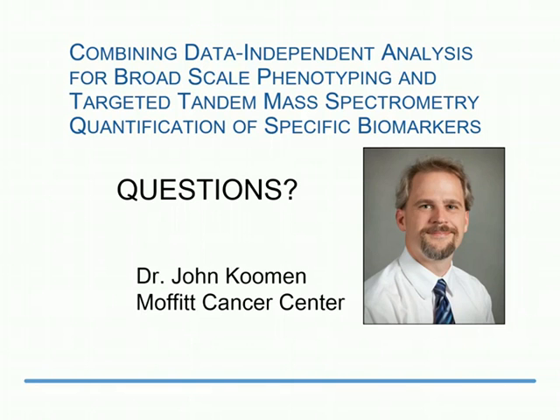So when we have biologists that we work with here, or we have clinical faculty that have a research question, they always come to us in the context of something else. So if a particular signaling pathway is active for the basic scientist, or the clinicians want to evaluate a lot of other phenotypic information in the context of, say, HER2 positive or HER2 negative breast tumors, then you always want to have that specific information that you obtain, and that's the reason for the hybrid acquisition. We have used this technique also to study post-translational modifications.